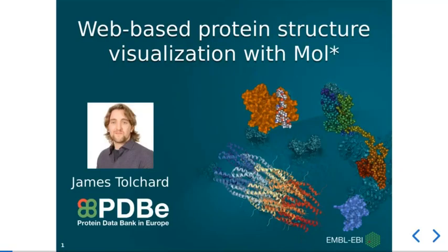Right, so welcome to this EMBL-EBI training webinar that's going to look at the Mol* web tool for visualizing 3D molecular structures. My name is James Tolchard and I'm a data curator here at PDBe Europe.